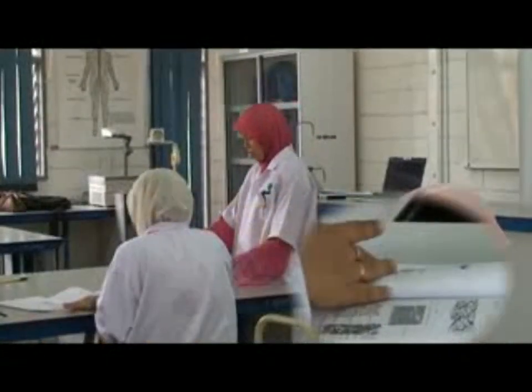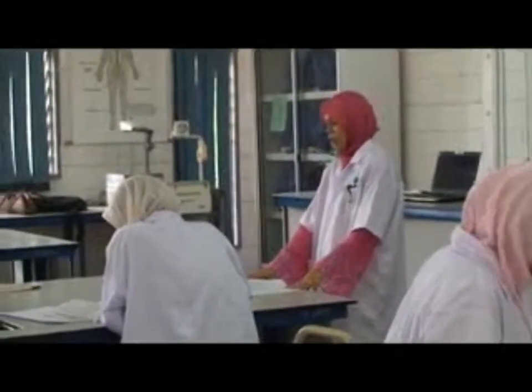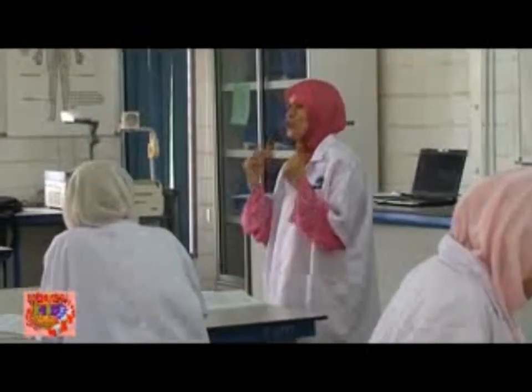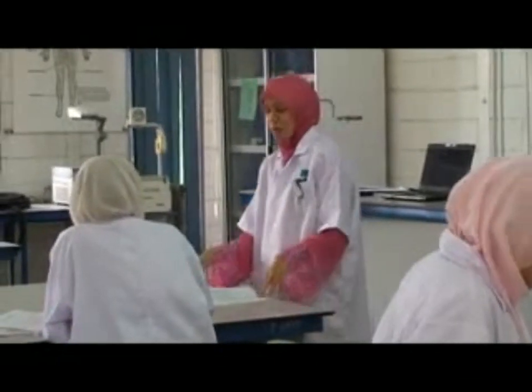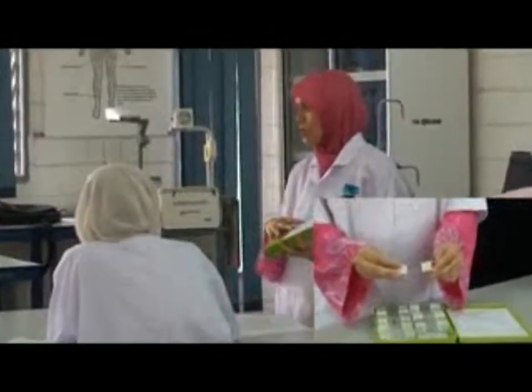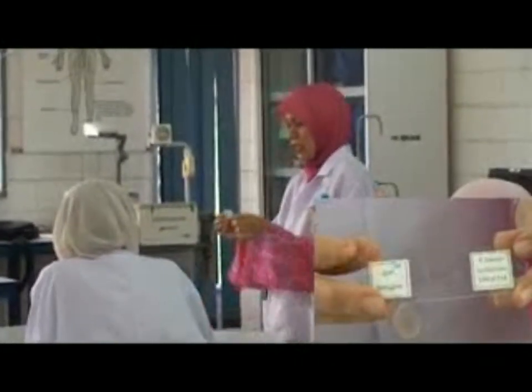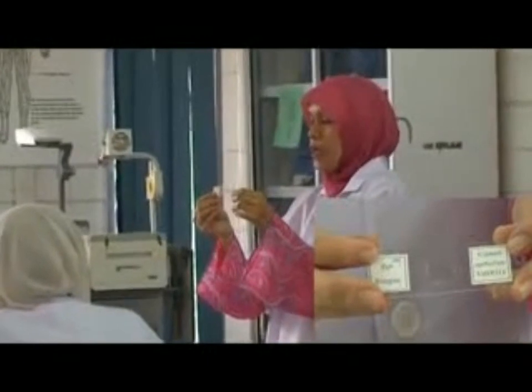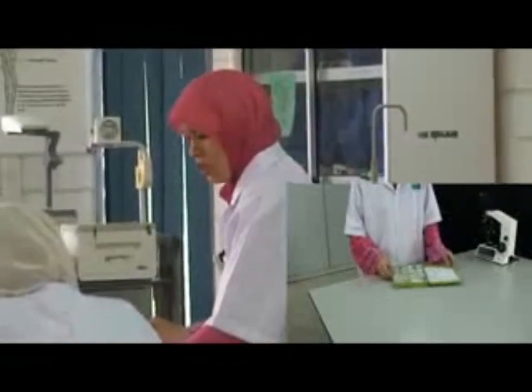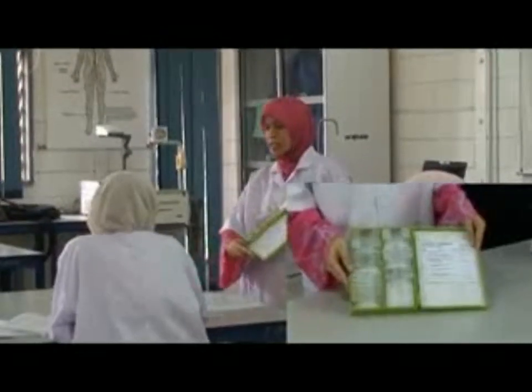Now please refer to your lab manual exercise 3.1 materials. You won't be doing any slide preparation, which means that you won't have to scrape your precious cheek cells to do this experiment, but you are supplied with the prepared slide for all the tissues in these 2 boxes. You will find the name of the specimen at the end here. And after you have finished using the slide, I want you to arrange the slides according to the list in each box here.